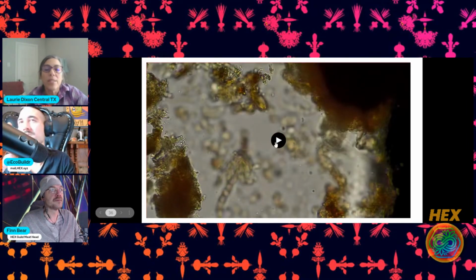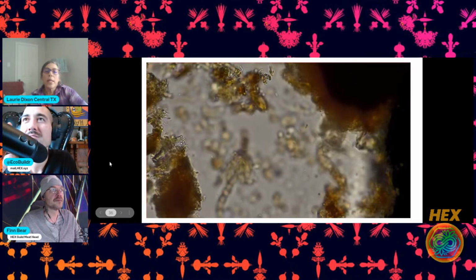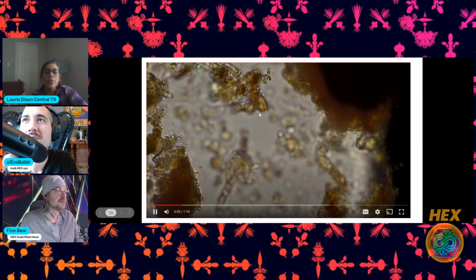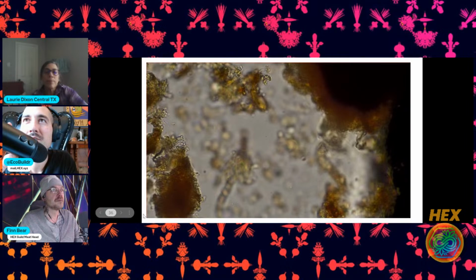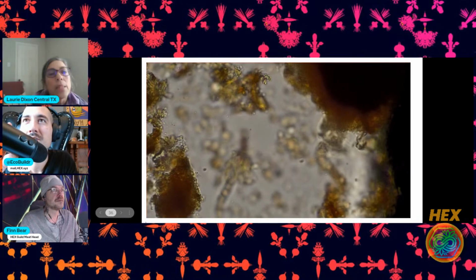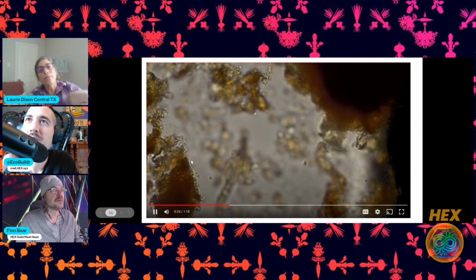I love this one. This is from the Fungi Compost Company, and he does Johnson Su compost. You can see that flagellate right there, spinning, spinning, spinning. If you look closely, you can see a very faint tail going down into the drop.